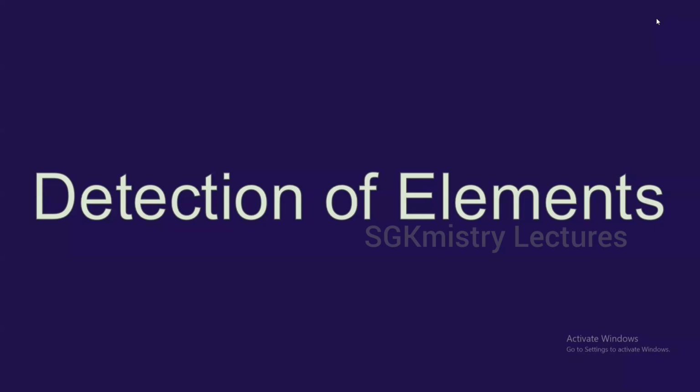Because if first itself you're going to spend more of your time in determination of these physical constants, then there may be time constraints, because of which you may not get enough time to perform all the other tests that are required. Right. So next, coming on to the detection of elements. So the third step that is required to be performed during organic analysis.